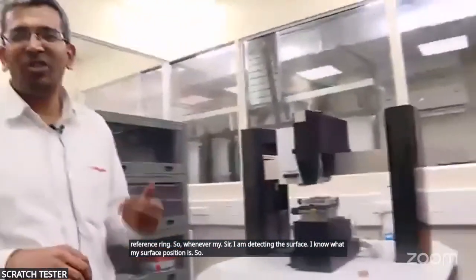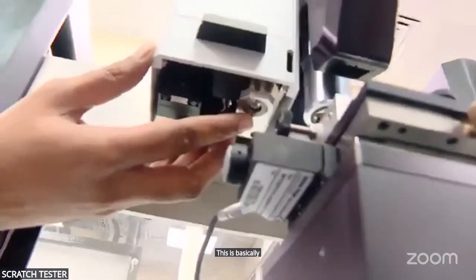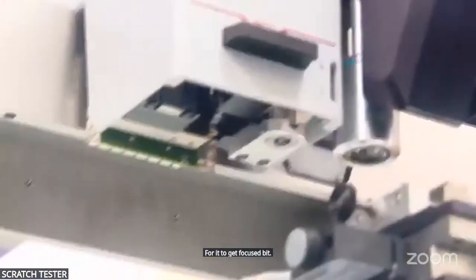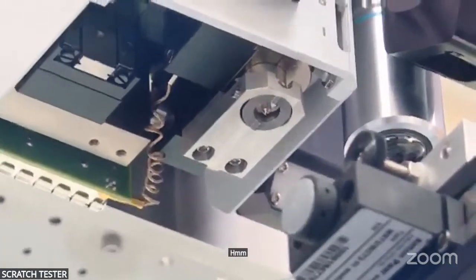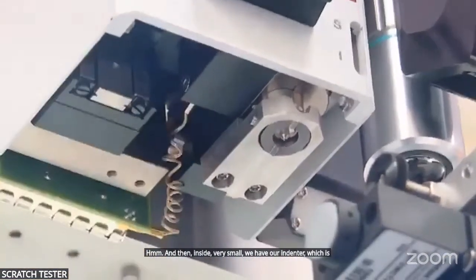In the first session you have clearly seen, if you can move, yeah, you can see this ring here. This is basically the part of the reference ring which goes on the sample and detects. Let's wait for it to get focused a bit. I think it's fine. Yeah. So this is the small ring. If you see, I am touching it. This is the reference ring. And then inside, very small, we have our indenter, which is the Vickers indenter here.